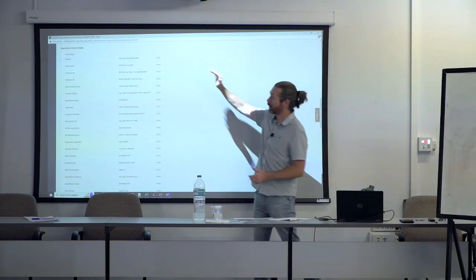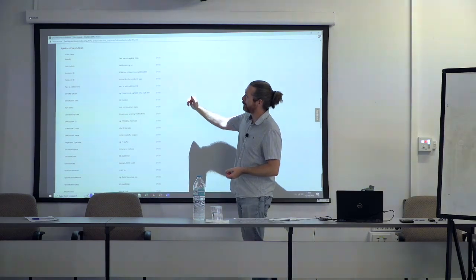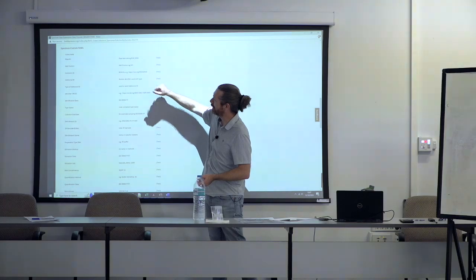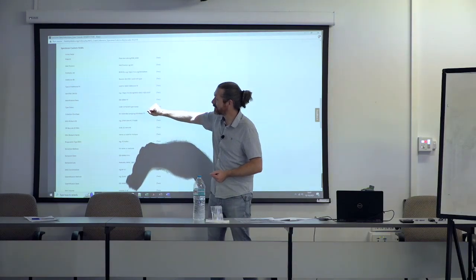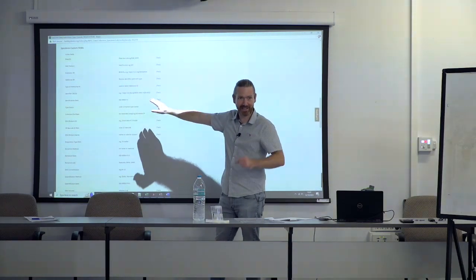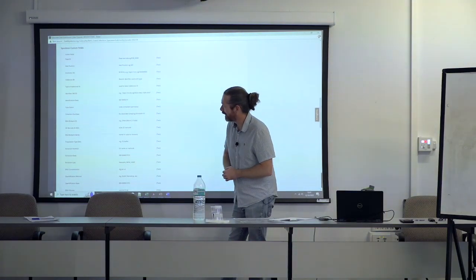But you can add your own custom data fields. So in the BGE project, we've got things like the plate identifier, the well position, the institution ID, additional ID. Great. What does that mean? Type of additional ID. This is all text, of course. So Rutger loves it. Yeah. Dates and various other things.